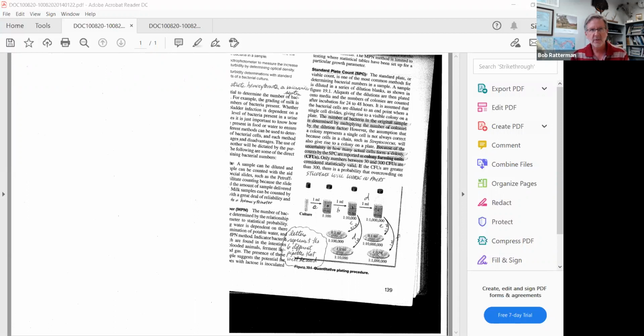There'll be some points associated with the answer to your questions as you evaluate what do you see when you look at this slide. What's the morphology of the cells? Is it showing a gram-positive or a gram-negative test result? Do you find this to be an endospore former or not? This is all based upon the results of your stain.